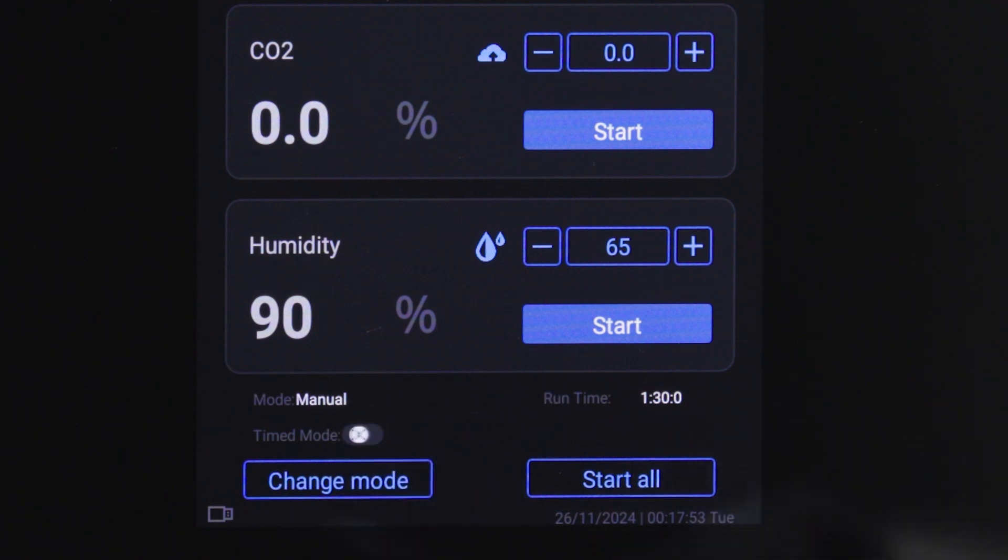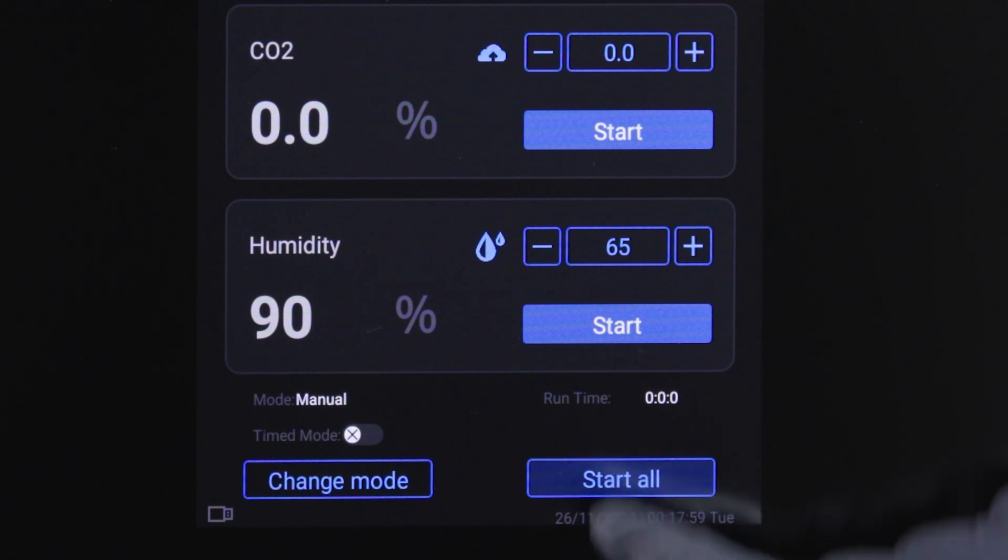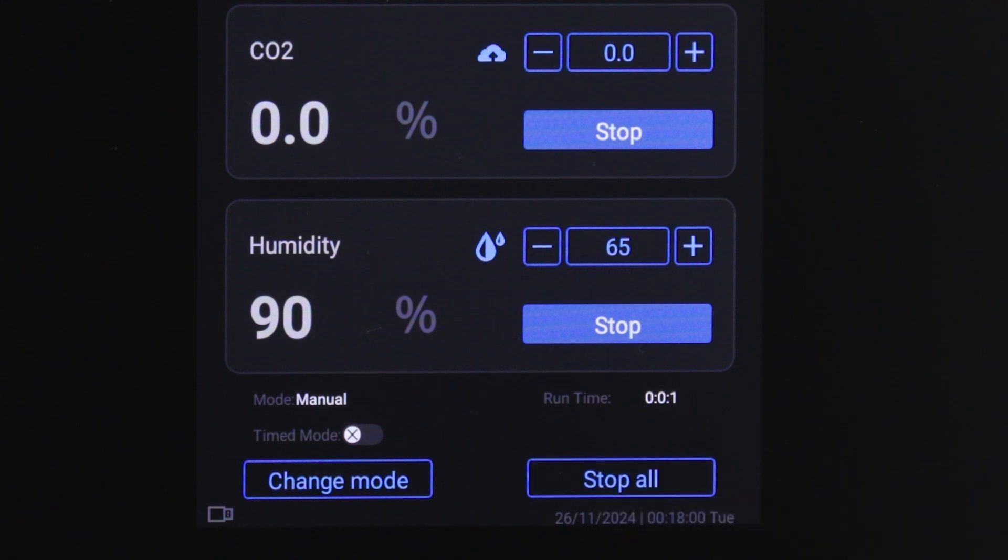In continuous mode, the timed mode selector will be off and the timer on the right side will track time in ascending order.